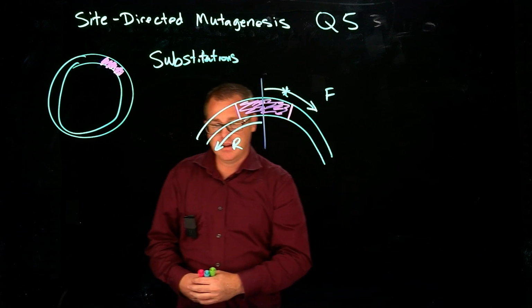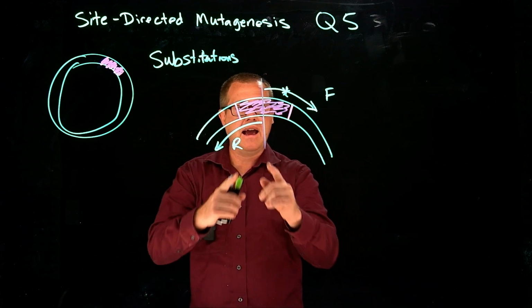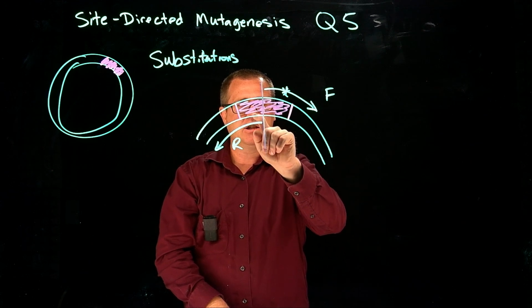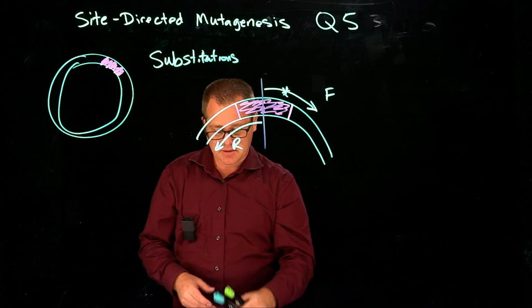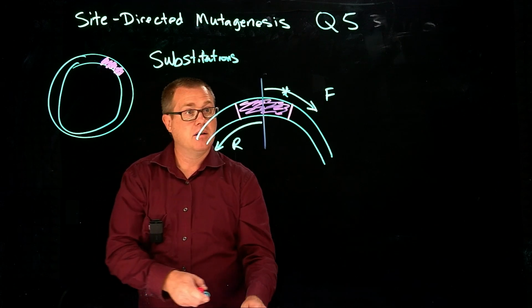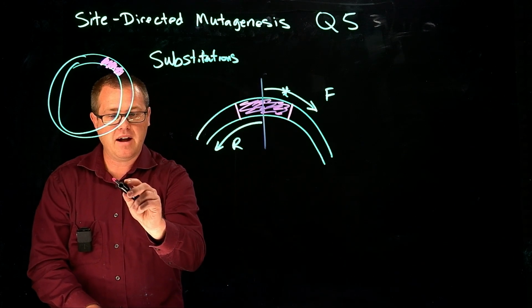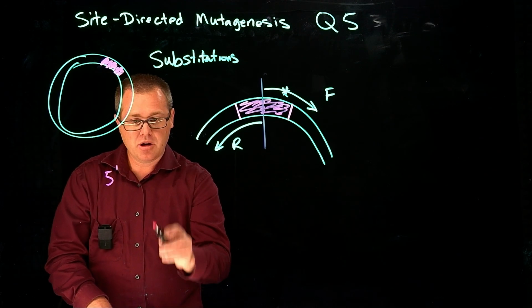So when we zoom in, what we're going to do now is we're not going to zoom into the whole gene. We're just going to zoom in just a little bit of the gene and write its sequence, okay? So what we have here, let's use this color here. Okay, so we have our 5' end, and I'm going to type in the codons like this.